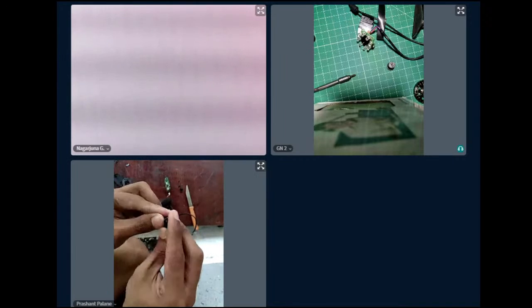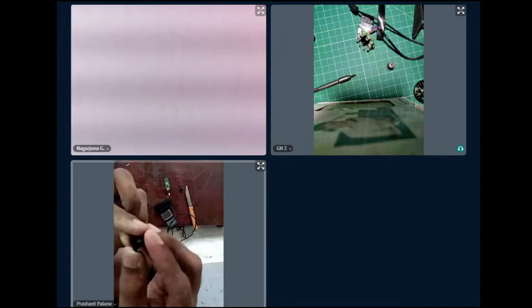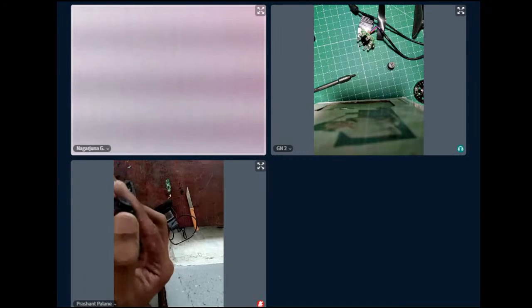Be careful. Is it turning? It can be turned. Yeah. So remove that. Then that lens can be removed. Carefully, when you remove it, do it on a tabletop surface, so that even if it falls, it will fall not on the floor but on the table.